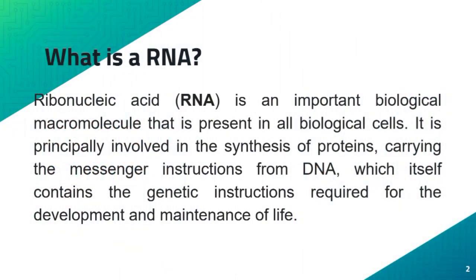What is RNA? Otherwise ribonucleic acid, which is an important biological macromolecule that is present in all biological cells. It is principally involved in the synthesis of proteins and carries out the messenger instruction from the DNA, which itself contains the genetic instructions required for the development and maintenance of life.